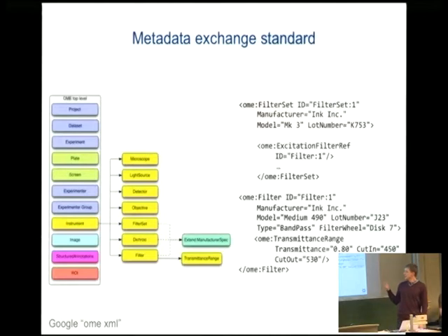This is also then exported into XML, so OME-TIFF and OME-XML are two parts of the whole project which allow easy exchange of that image. So if someone exports, let's say, a Nikon proprietary file format into OME-TIFF, they can give this image to any scientist that wants to see it, and if that scientist works either on OMERO, which is the product that we provide to users, or any OME-aware piece of software, they can instantly import that image and not lose any data on the way, and work with it without being fenced into this specific format.